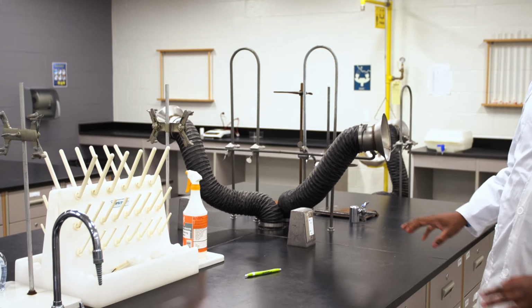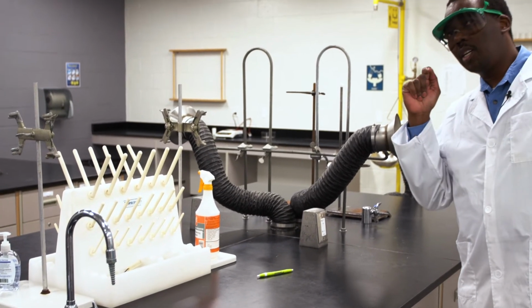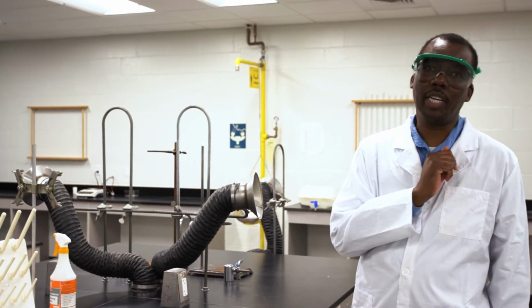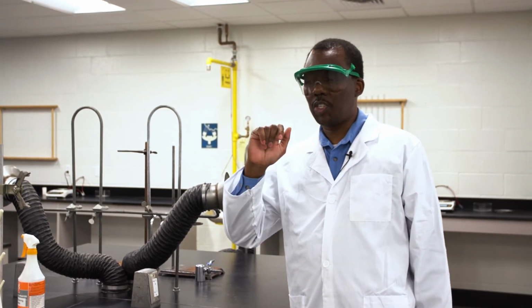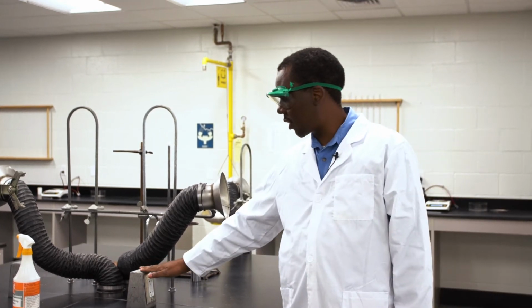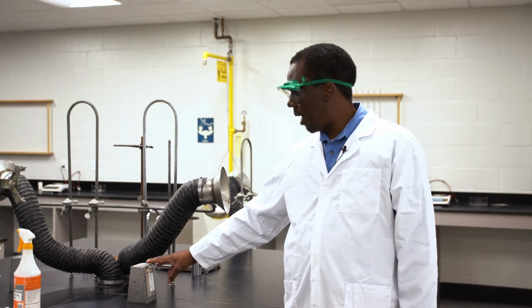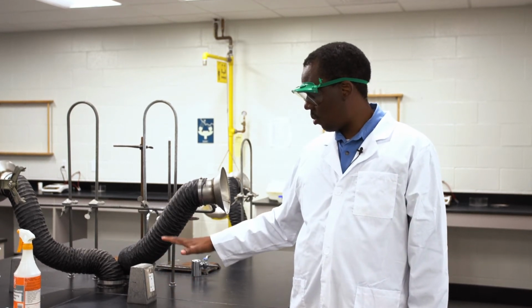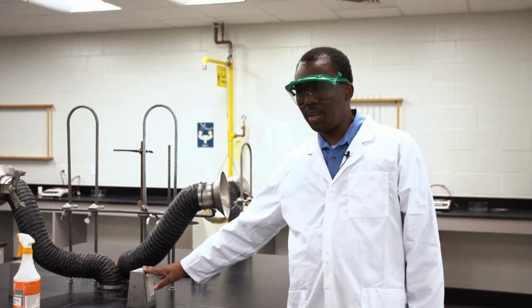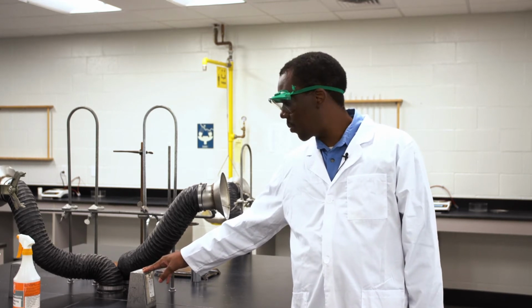In addition to all this work area, there is an electricity cut-off switch, which I will show later. It's simply a red knob that you push and it will cut power to this power outlet, so that if the emergency had to do with your electrical equipment, then the power will be cut and we'll stop that emergency in that way.